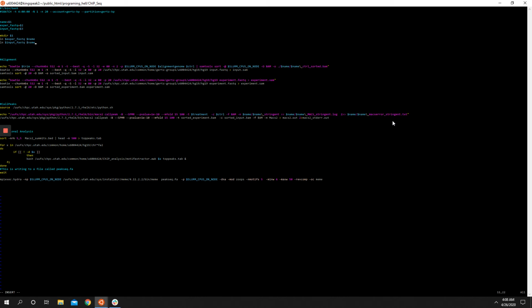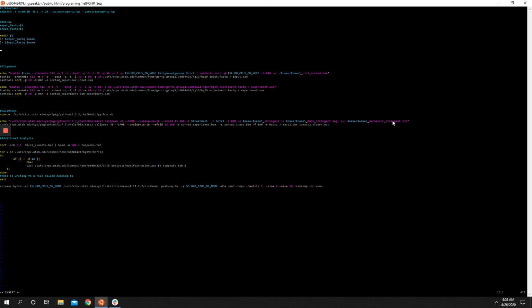So now we've got our FASTQ files in there. Linking is just like making a shortcut. We're just putting them there, but we're not copying anything, and we're not moving the original file. So we've basically got copies in both spots, but they only take up the space of one file. It's magic. Ask me about it if you want me to explain it further.